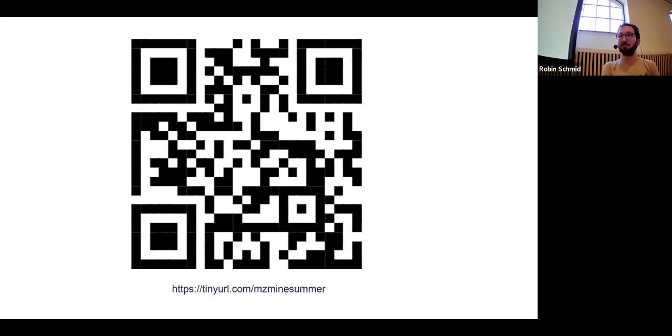Then there's the MassBank of North America LCMS mass positive library, a spectral reference library. We mostly use this library because it's medium size, like 90,000 spectra, so it's kind of small. So it's going to run on all the laptops quite easily. And if you have GNPS downloaded, if you have any other libraries, you can also just plug them in and use them.